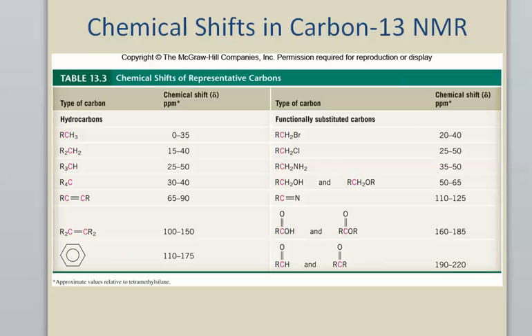And just as with hydrogens, we've got a correlation table where we've got a range of chemical shifts that are associated with carbons in certain environments. We just saw in acetone the carbonyl carbon, and you can see the highest chemical shifts are associated with carbonyl compounds. Acids and esters give chemical shifts between 160 and 185. The highest values of chemical shift, you can see that's going to correspond to aldehydes and ketones. At the other end, when you have just CH3, CH2 group carbons in regular alkanes, they have the lowest of chemical shifts, just as those hydrogens have low chemical shifts in the hydrogen NMR.